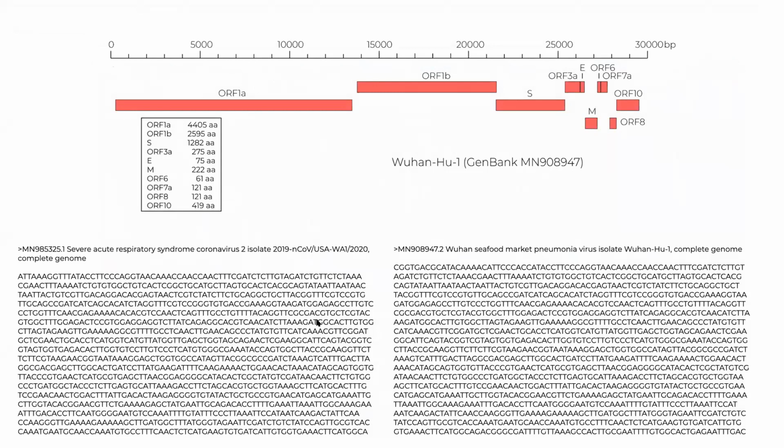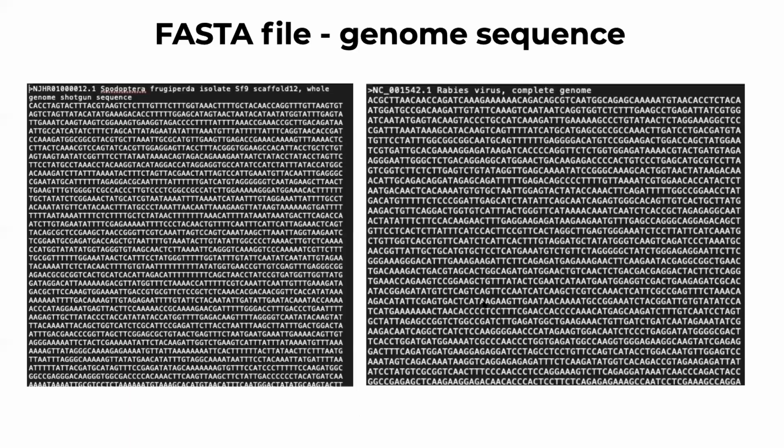And so as we look at the specific genomes and as we look at the specific sequences, now we can study their variation. In the FASTA file, just so that everybody is clear, we have this continuous sequence of an individual genome or a portion of that genome. Not every genome is a complete genome. Some genomes that you will find in a variety of publicly available databases are partial.